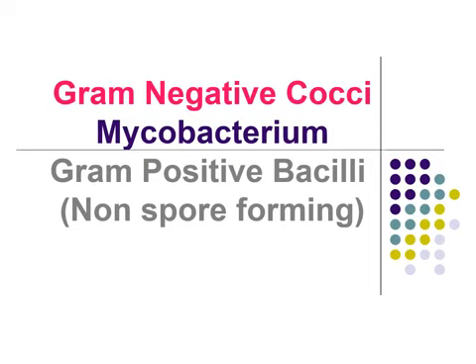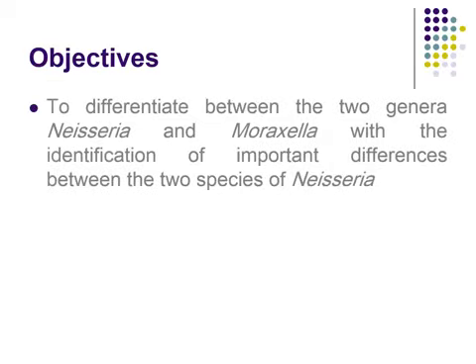So in this practical session we're going to know how we can differentiate between the two genera Neisseria and Moraxella, with the identification of important differences between the two species.